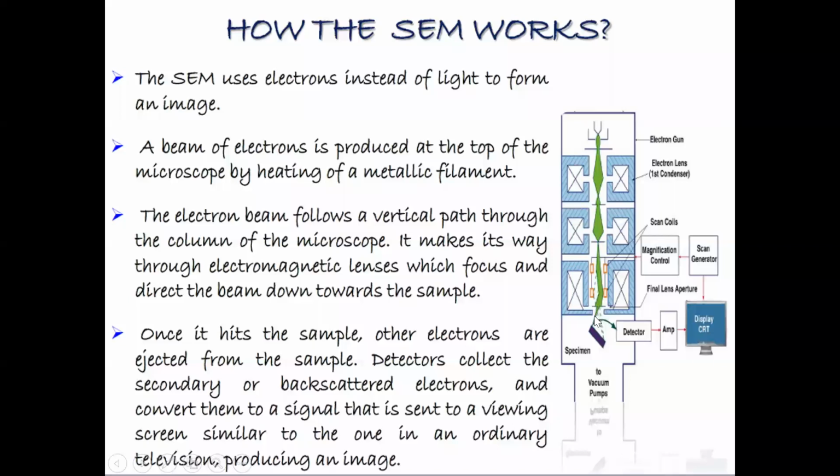Once you pass the electron beam towards the sample, the phenomena are observed, and here the three kinds of detectors are there: the secondary, the X-ray and the backscatter detector. Once they recognize your signals, they are amplified and come to your computer, and the computer displays your spectra. Okay. So what is the exact working of your SEM instrument?